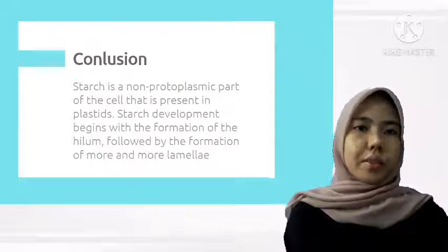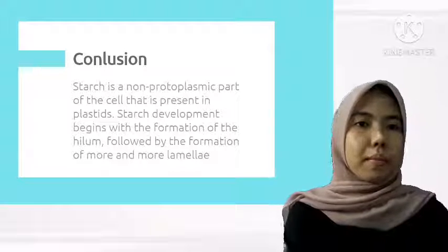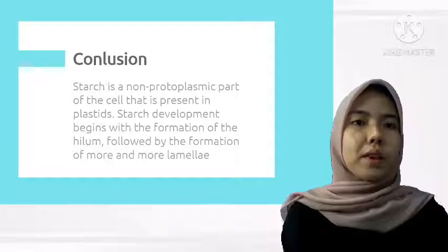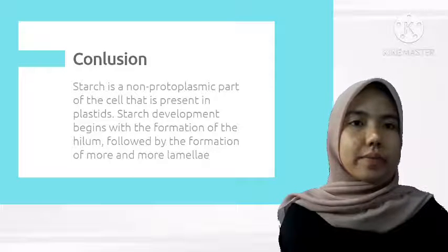The conclusion of this material is that starch is a non-protoplasmic part of the cell that is present in plastids. The development of starch begins with the formation of the hilum, followed by increasing layers of lamellae.